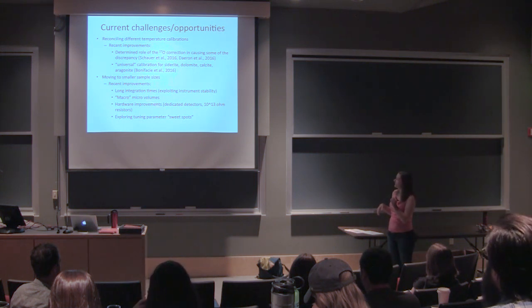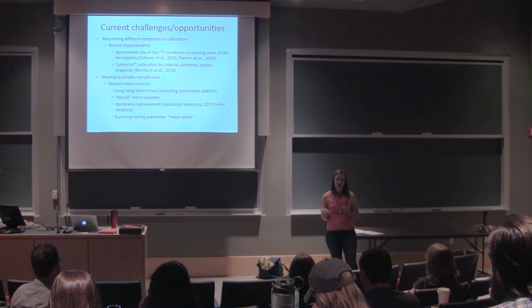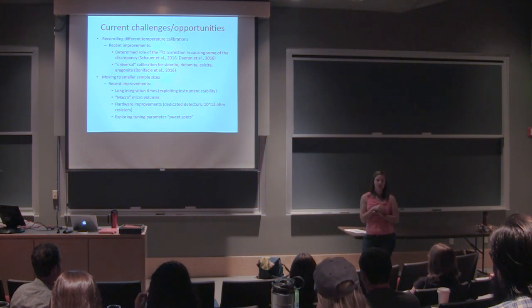So I'll talk about the mass spec we have at CU Boulder, which is one of the newer Thermo instruments, where they've made a bunch of changes to help get to smaller sample sizes. And in our lab, I literally got these text messages yesterday. I think we can comfortably measure, still using the bellows, at about 1.5 to 2 milligrams instead of 8 to 10, which is phenomenal for me.